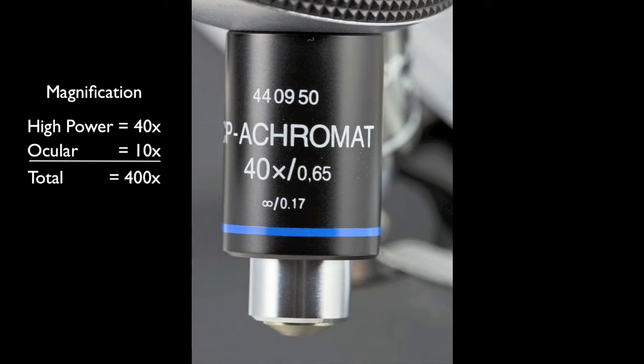One note of caution. Some students become concerned when turning the high power objective into place because it looks like it might strike the slide and possibly break it. These students make the mistake of lowering the stage before turning the lens into place. This will actually increase the chances of damaging the slide because it is now necessary to move the stage upwards with the coarse focusing knob.